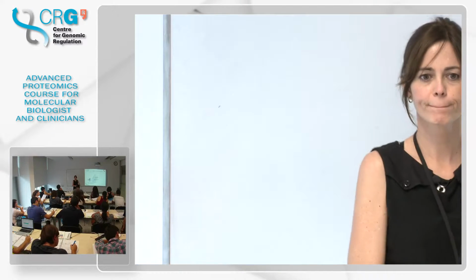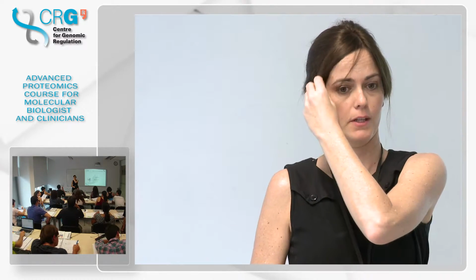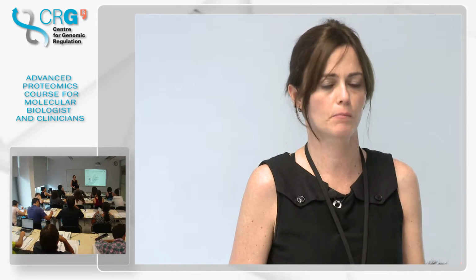Even if you use another mass spec, you have to use the same fragmentation method. And yeah, in general, we like to use HCD fragmentation. CID is also pretty similar. And you can also use the same instrument. But in general, the fragmentation pattern will not change that much. Which ions you see and in which rank of intensity should be pretty similar.